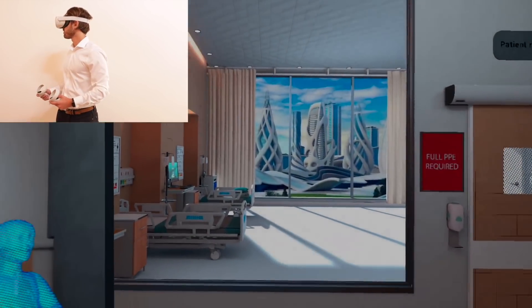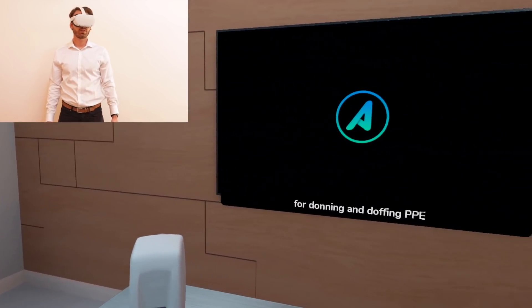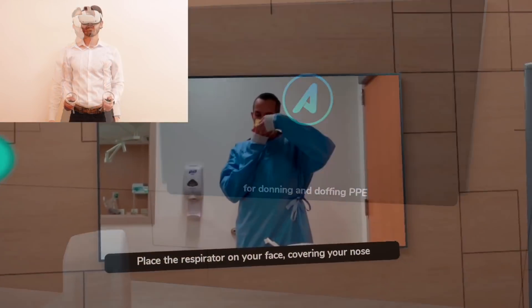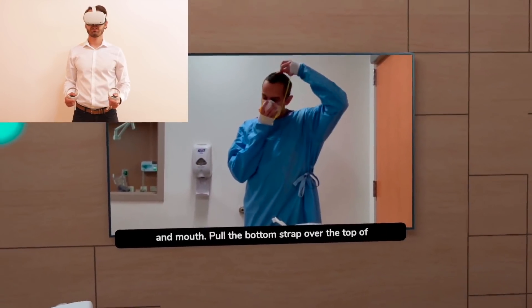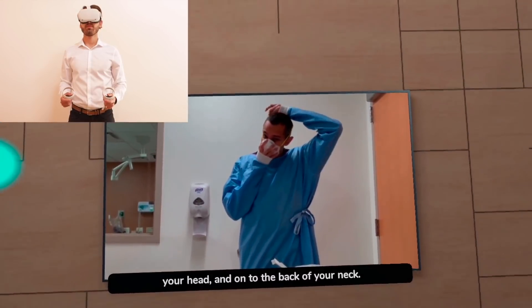Welcome to the Axon Park Medical Complex. In this tutorial, you'll learn the process for donning and doffing PPE. Place the respirator on your face, covering your nose and mouth. Pull the bottom strap over the top of your head and onto the back of your neck.